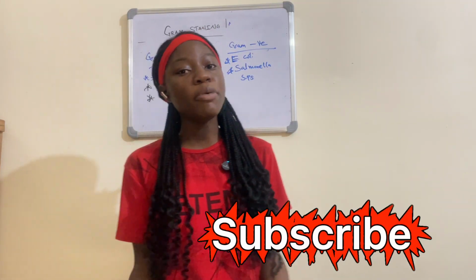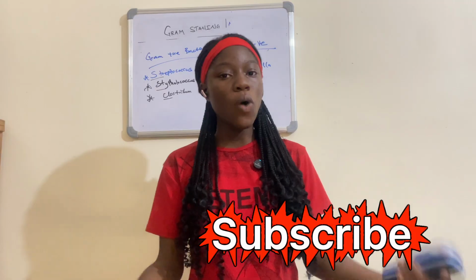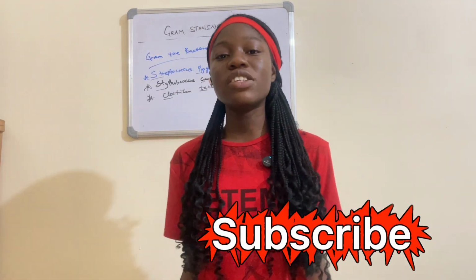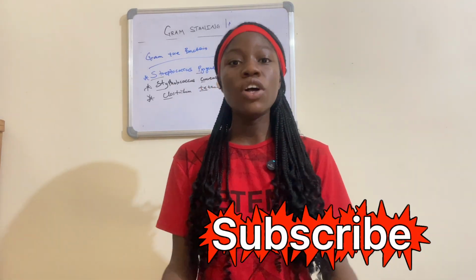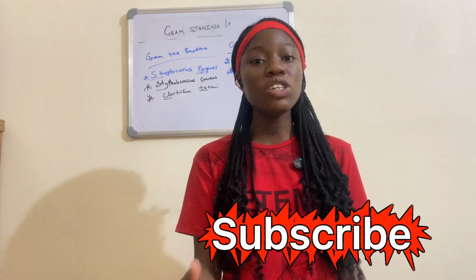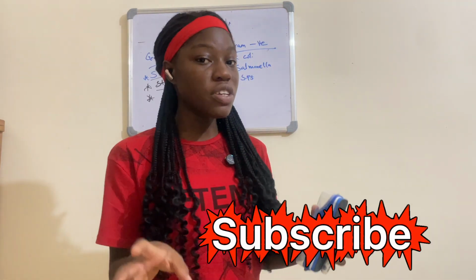Now you might be wondering, why are we studying Gram staining, or why do we need to do Gram staining in the lab? We do Gram staining because it helps us differentiate between gram-positive and gram-negative bacteria. It also helps us in the treatment plan, to know which antibiotics to give to the patient. So it's very important.